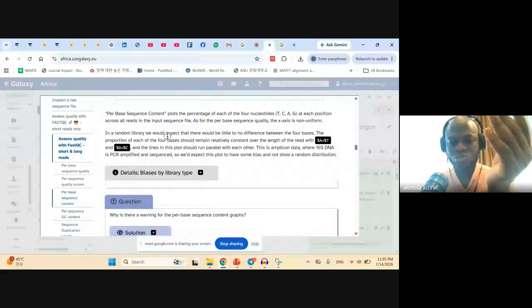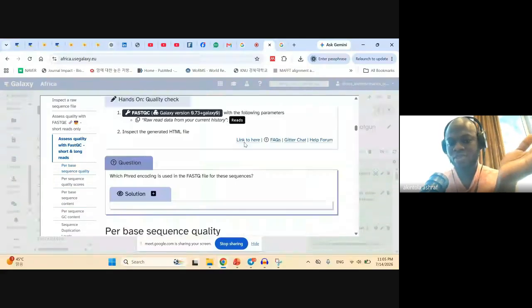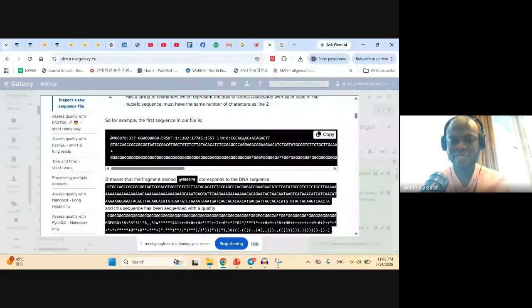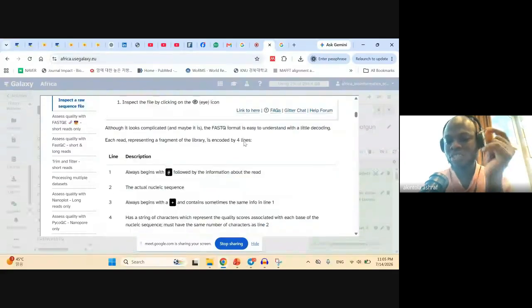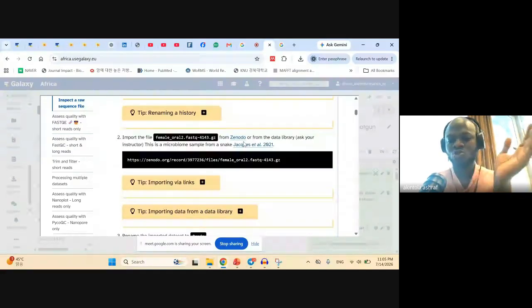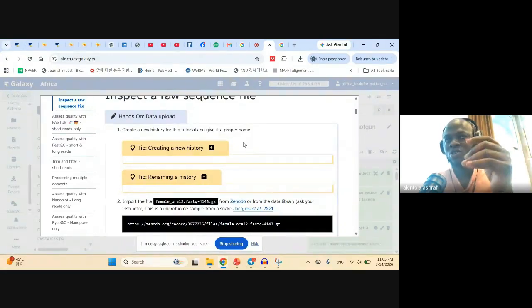I'm going to take us through just the first few steps to give us a taste, which would be a take-home for attending this class: quality control, the most essential part. If your quality control is good, your other analysis is good. If your quality control is bad, your other analysis is going to be bad. We are establishing a foundation so that every other building erected on top is going to come out strong and fine.